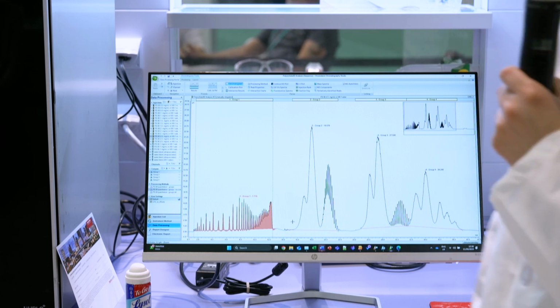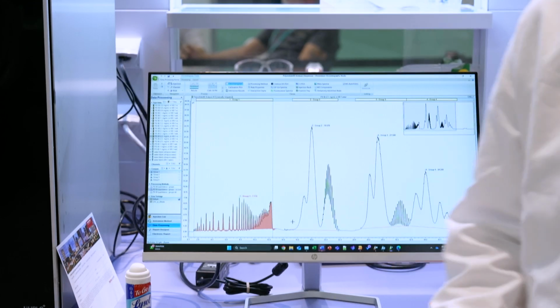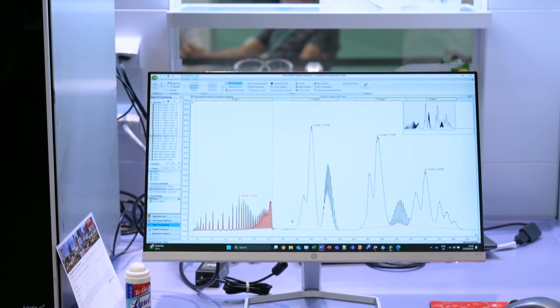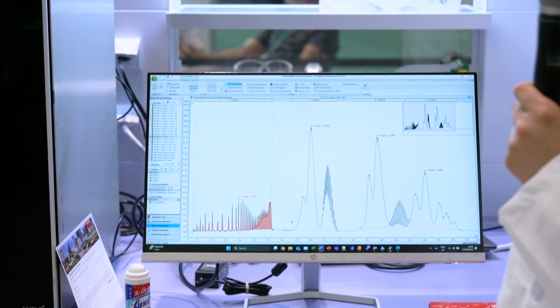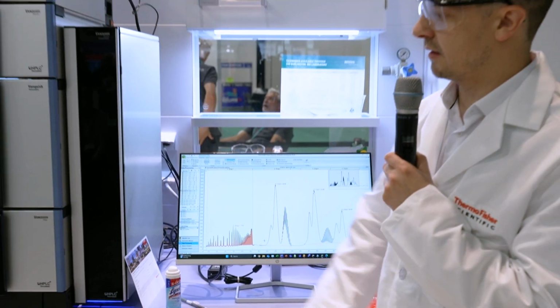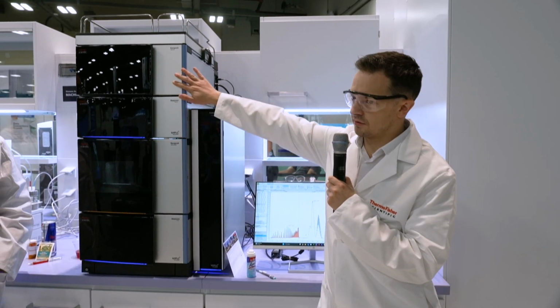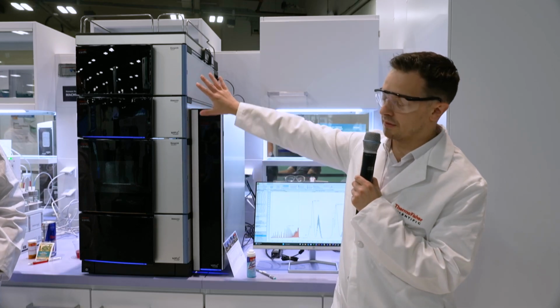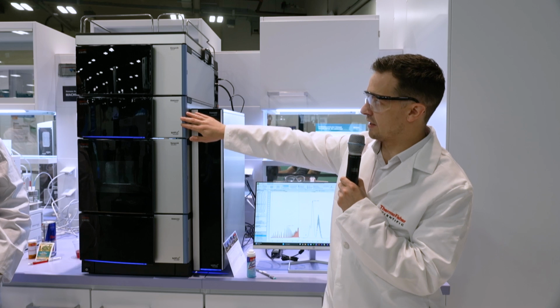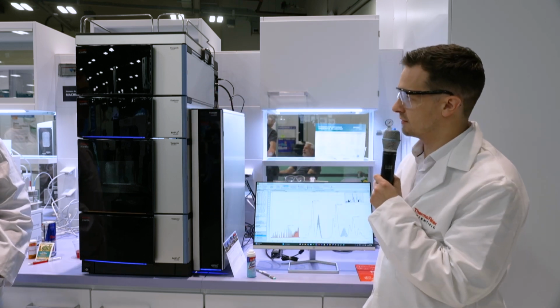So that's essentially the CAD, and you might be thinking, well, could we not use a mass spec for this type of analysis? And you are right, you can use mass spectrometry for Polysorbate 80 analysis, but what we say is that the CAD is a very complementary technique. So you'll see in this particular setup, we've got UV detection and also the charged aerosol detection, so this is a common setup. You've got UV for chromophoric compound quantitation, and then the charged aerosol detector for non-chromophoric compound quantitation.